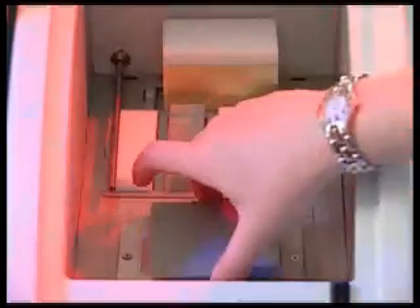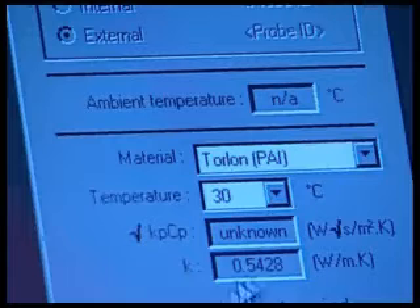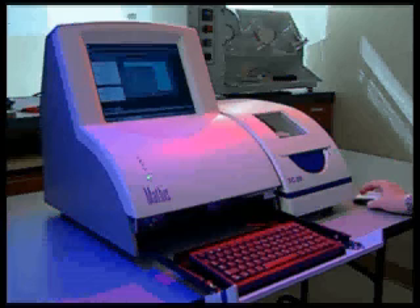The sample is placed on the Mathis spring-loaded sensor and the supplied weight is placed on top of the sample to ensure proper contact. The Mathis software then prompts the tester to enter sample information on screen in the appropriate fields. The automated testing procedure is initiated with the click of the mouse and requires only seconds to complete.